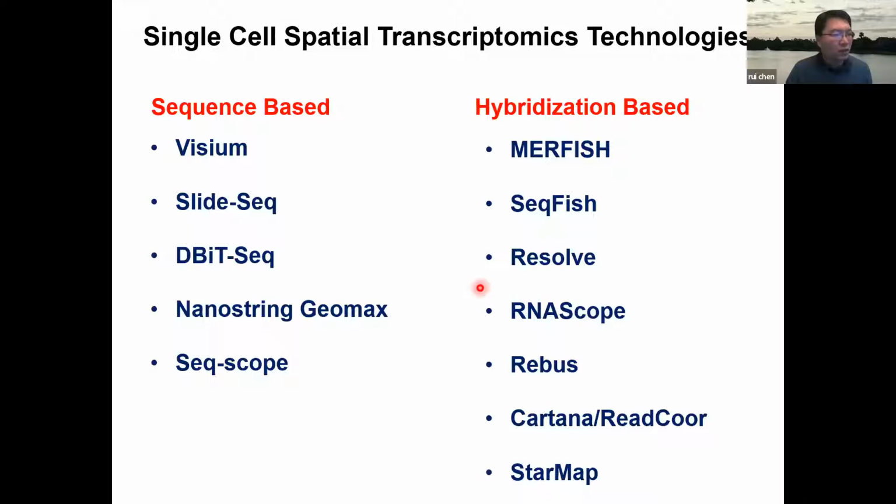However, on the other hand, because they use in situ hybridization, their sensitivity can reach 80% or higher, so they're very sensitive in picking up things. So today I will mainly share, as I mentioned, our experience using MERFISH.